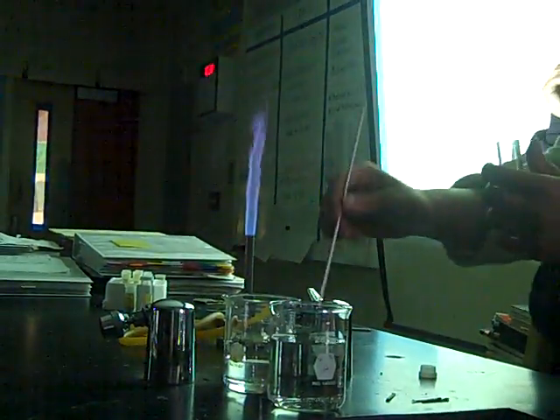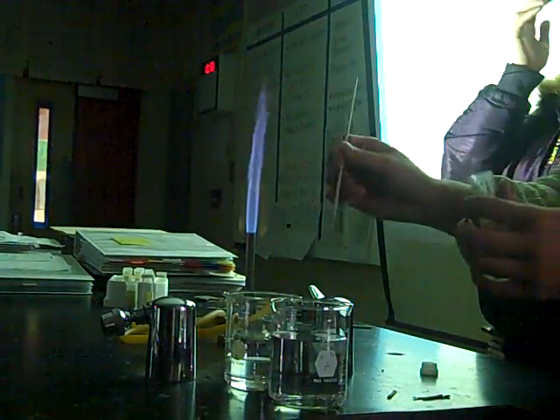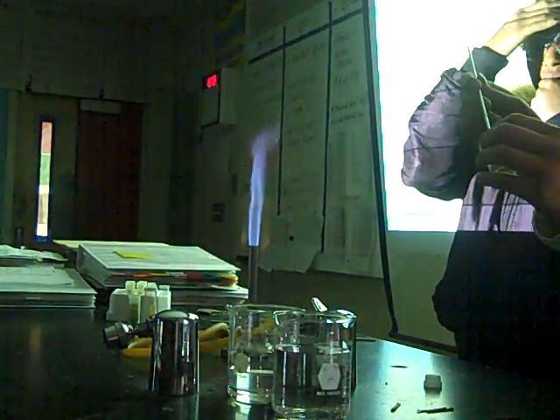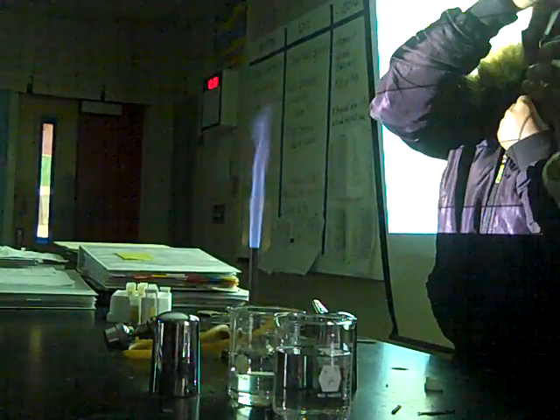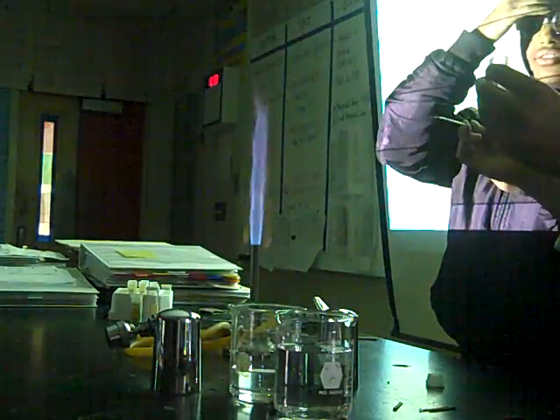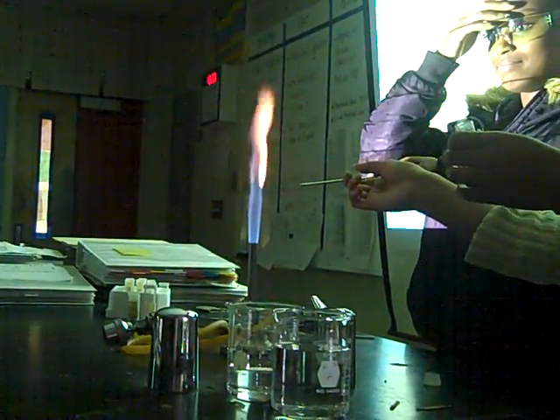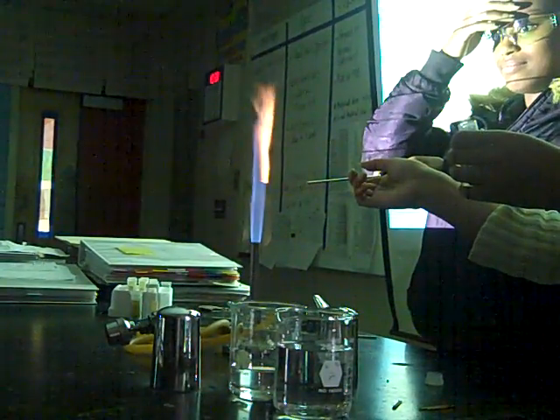All right, so this is potassium chloride, KCL. Let me see, I'll make sure I've got lots of it up on here. Okay, try that. Put it right in there. Ooh, okay.